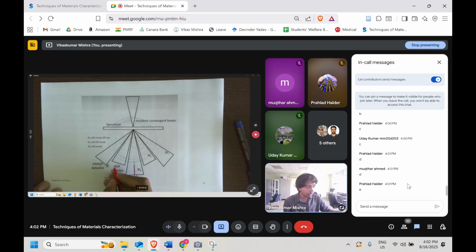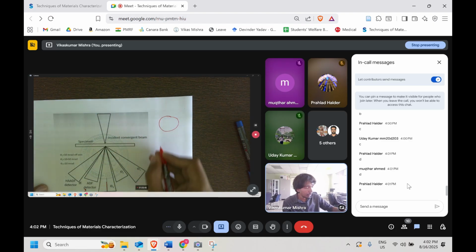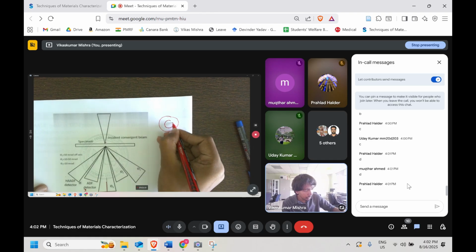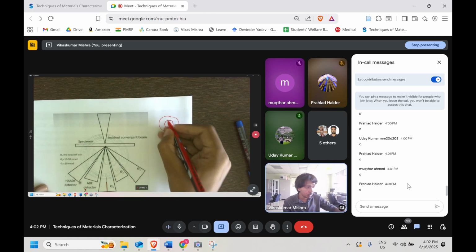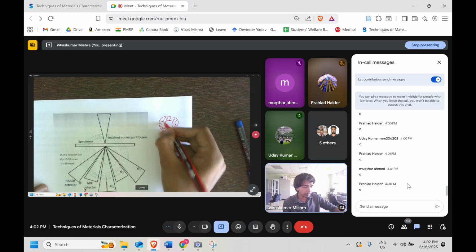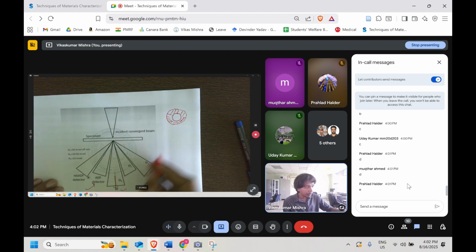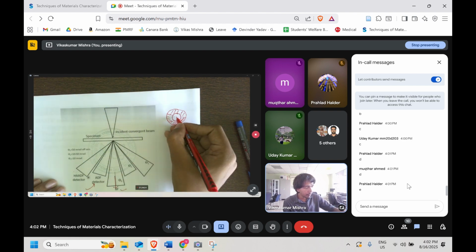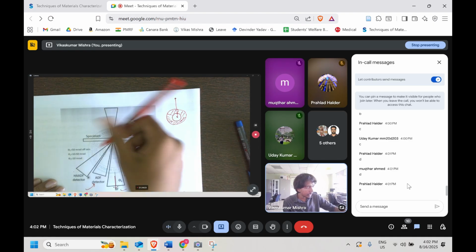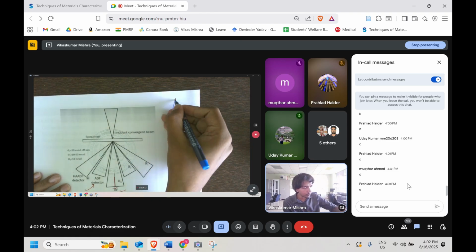First of all, annular means it's something like this shape, and it will be something like this. This is hollow, so the detector is this much. So now it will not capture the direct beam, which will not go through it. Only the beams which are at a certain angle will go.